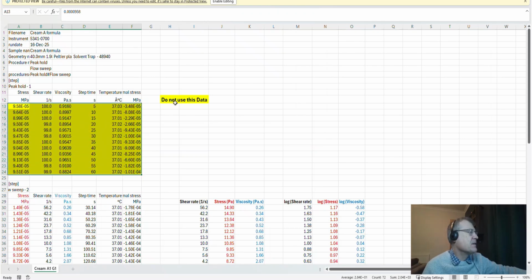What was happening there was when I put that onto the instrument, I first of all got it to rotate the sample very quickly and produce a lot of high shear, so it's kind of as though I'd put the cream between my hands and gone like that.